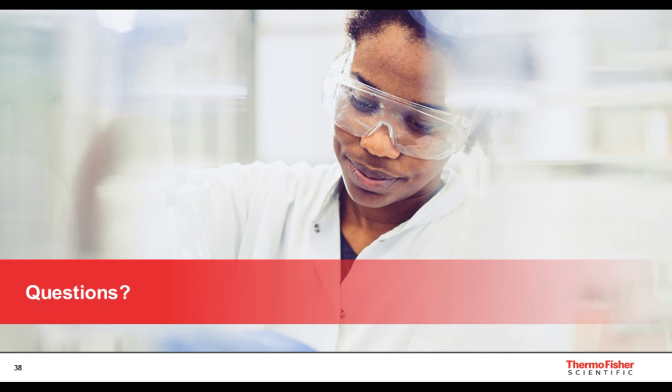We found that we can't really go much beyond 1.5 to 2 weeks, and I think that may be somewhat receptor dependent when you're storing them at 4 degrees. But I think our latest data is that we can go up to potentially 2 months at -20. So it's not indefinitely, but it is significantly helpful compared to having to isolate the receptors and doing all your assays same day.